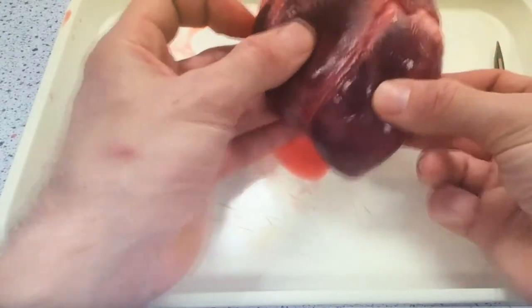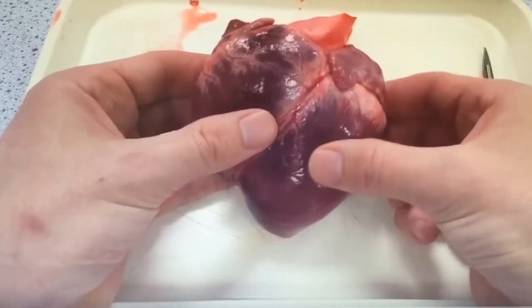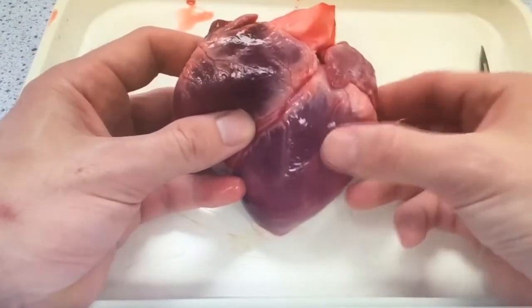Remember that the left chambers of the heart are much bigger than the right, and of course the ventricles are much bigger than the atria. Giving both sides a squeeze, you'll feel that the left side has a much thicker, more robust wall than the right side.